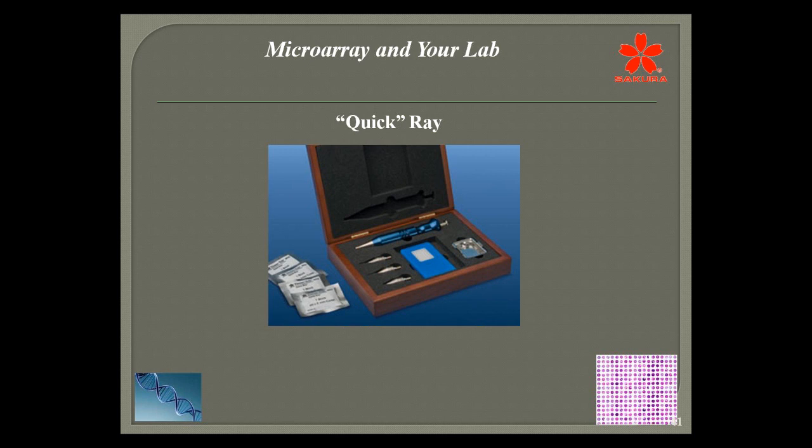These will serve as an insert, so to speak, that you will actually place your cores of tissue down in, and you'll place the little core set into the embedding mold, and you'll place the cores in the hole there corresponding with a grid or some form of identification.